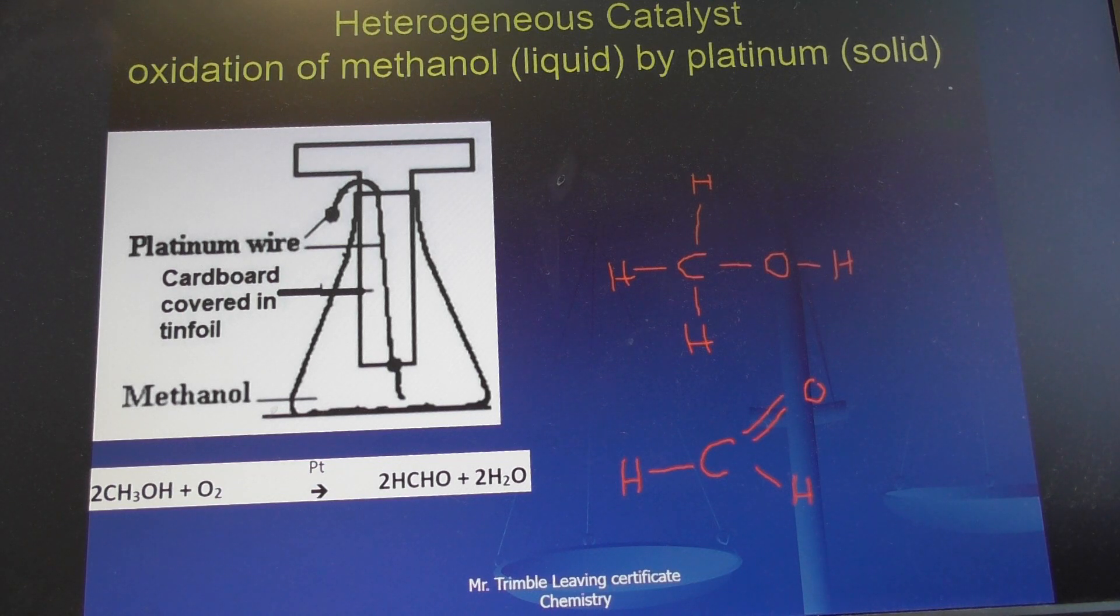That's the last of the experiments. It's a nice one that's demonstrated and has come on the exam papers a good few times. Methanal has quite a distinctive smell. The T-piece here acts as a chimney. The aluminium foil wraps around the T-piece protecting it from burning because it's cardboard.